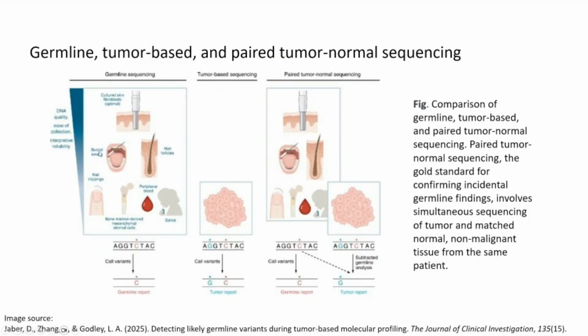Of course, for other whole genome sequencing, if we are studying some inherited disease, or we just want to check variations, whether some mutations are observed in certain patients, normally one-sample whole genome sequencing might be carried out.